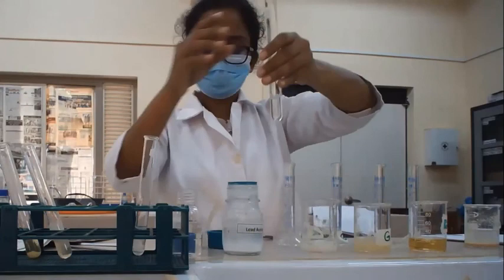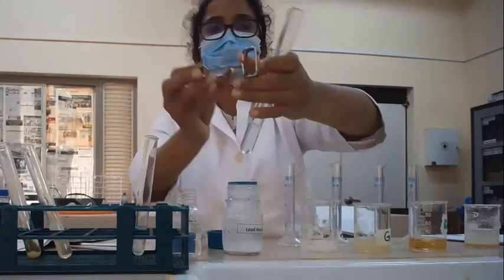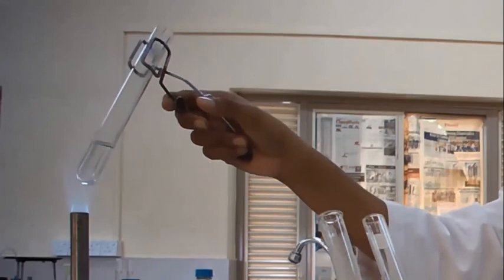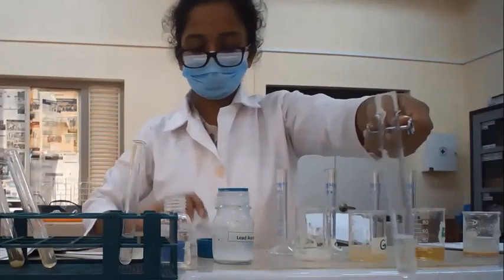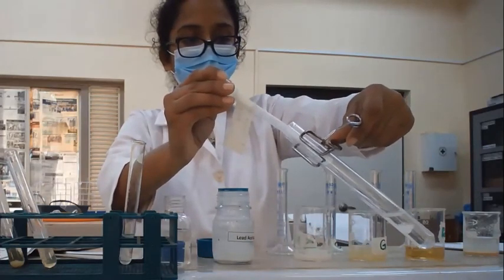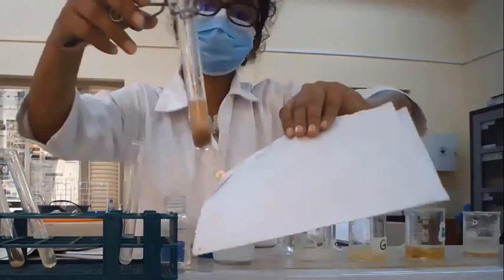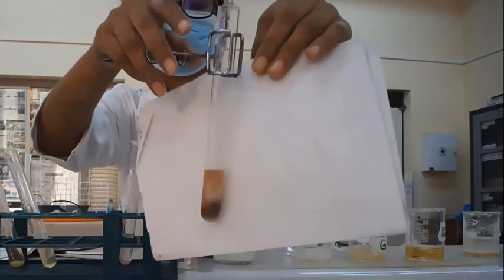Then I'm going to use the egg albumin sample. First add a few drops of sodium hydroxide. Then boil it in the burner. After boiling, I'm going to add lead acetate. After adding lead acetate into the egg albumin, you may see a black color precipitation in this test tube.